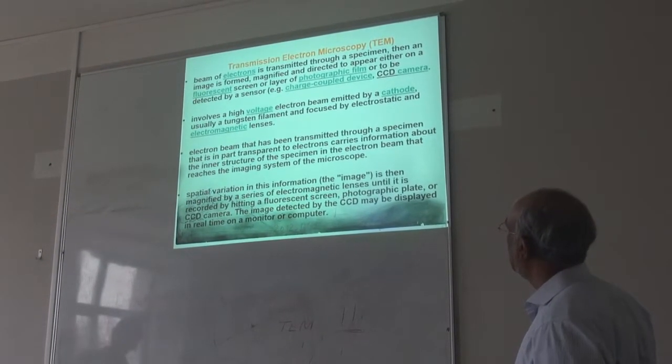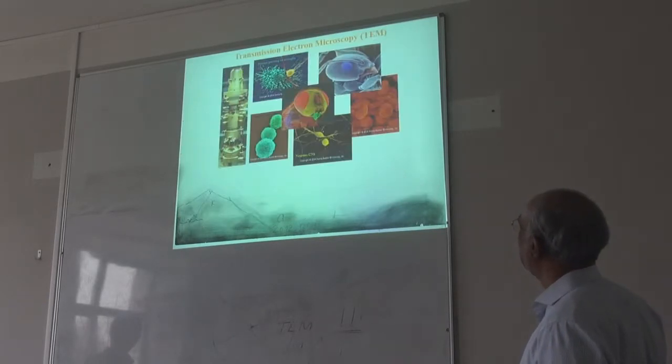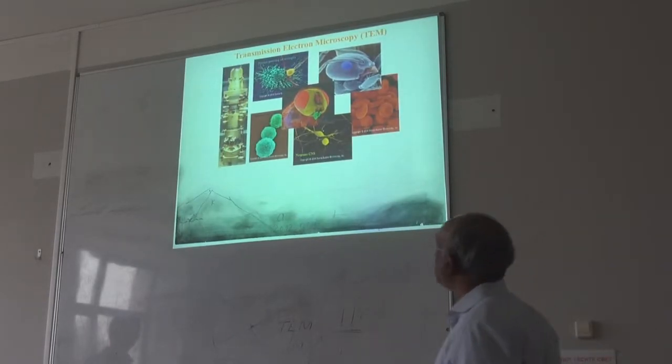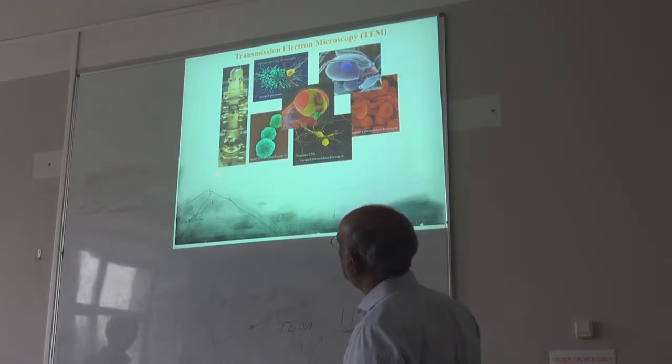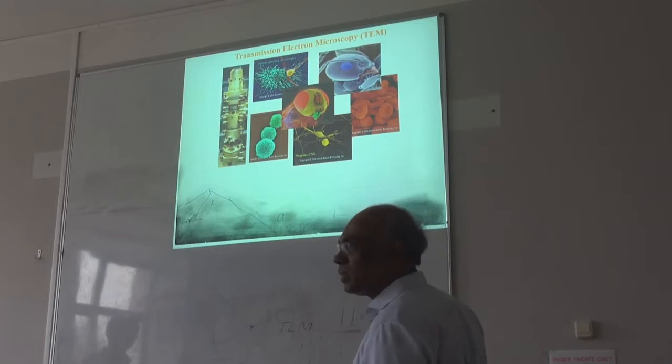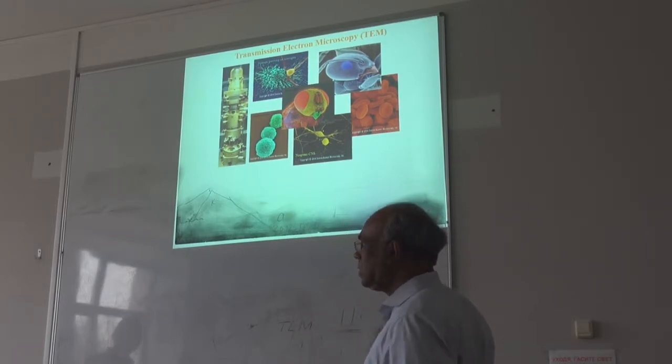So these are some details. I don't think I have to go through that. This is some typical transmission electron microscope. Do you have one here on this campus? We have one in the materials. No. It looks like this.